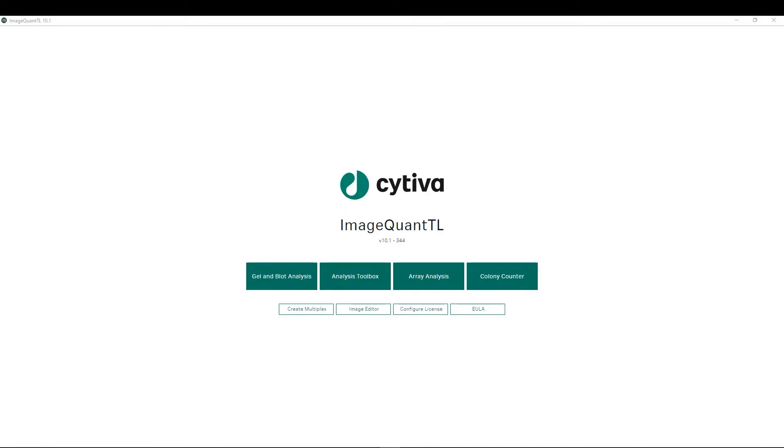The ImageQuantTL version 10 software is now available for both Mac and PC. The software supports a wide variety of file formats including TIFF, GEL and IMG as well as JPEG and PNG.